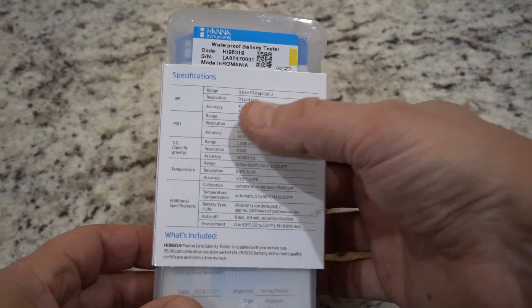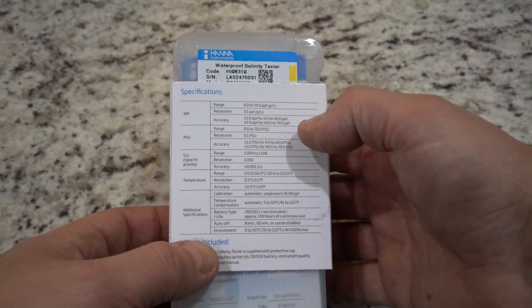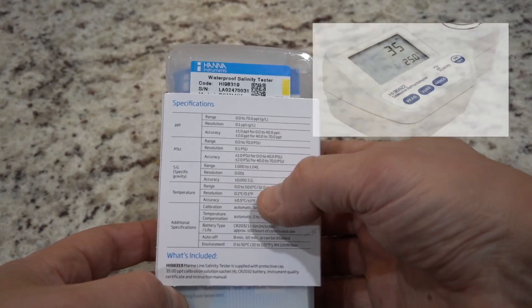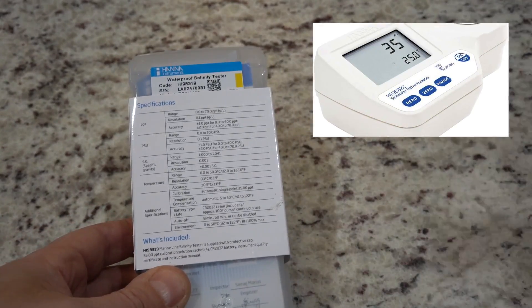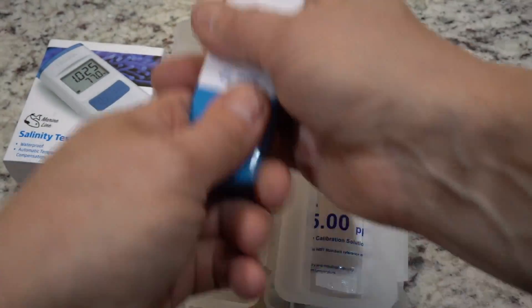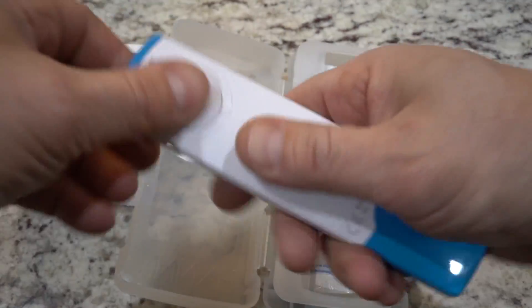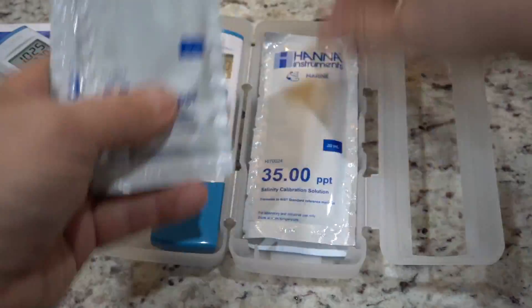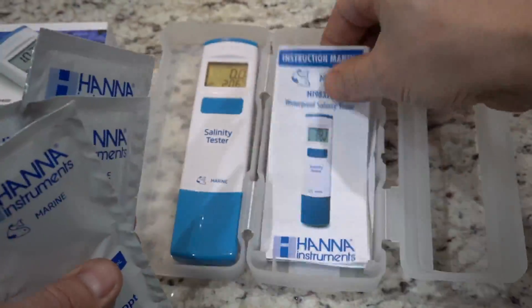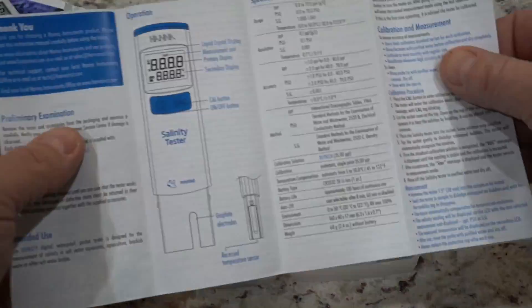The specifications are right in line with what else is in the market. Hanna of course makes the larger salinity refractometer — that meter is very expensive, $180. This one is very small, fits in the palm of your hand, and looks like it's completely waterproof. The little display runs off those little coin batteries. It comes with calibration fluid, which is cool, and a nice case for you to store it when you're done with it. I always like that.